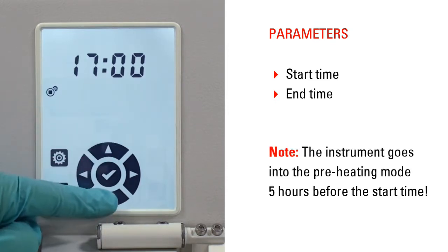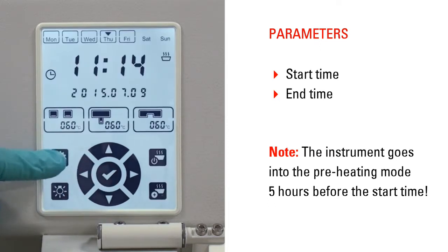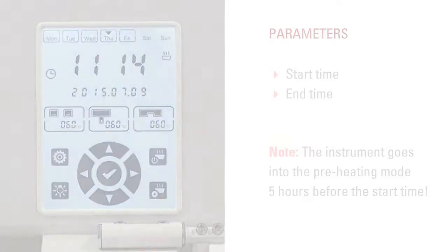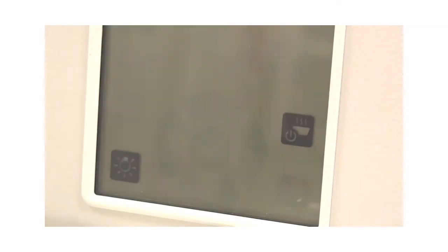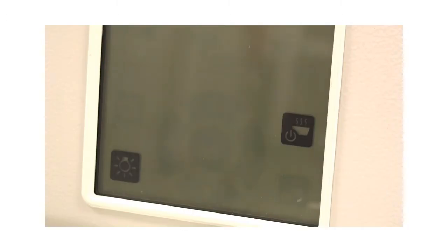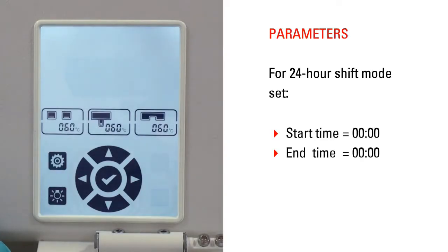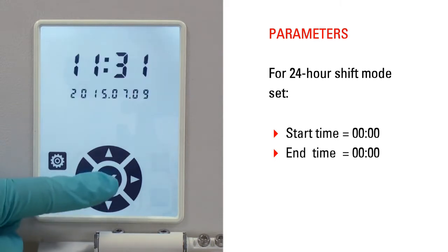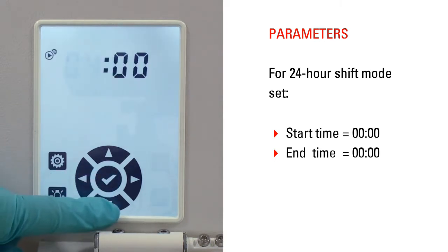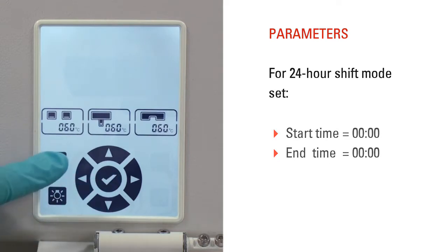Set start and end time of the desired operating mode with the control buttons. The instrument goes into the preheating mode 5 hours before the start time. The instrument switches on or off automatically at the programmed start and end times and goes into standby mode. The Arcadia embedding system is able to run in 24 hour shift mode. Set the start time and end time to the same value and the instrument will run continuously, even on days that are not defined as workdays.